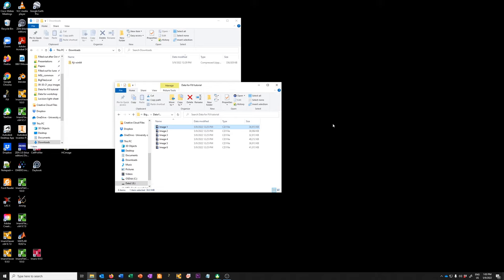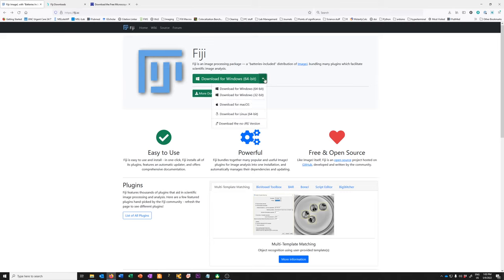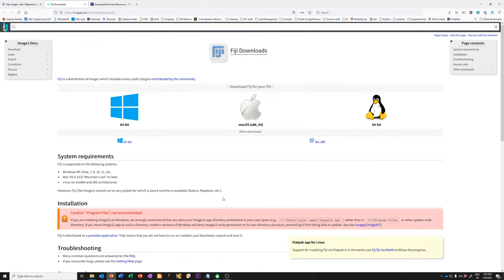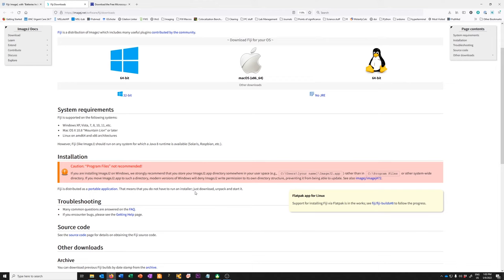The first thing is how do you get Fiji if you don't have it? You can go to the Fiji website at fiji.sc and download the version that's appropriate for you. I have Windows 64-bit so that's what I clicked on, but there are other options, and if you click on 'more downloads' you'll get further information on different versions as well as where you should and shouldn't install it, for example if you're on Windows.